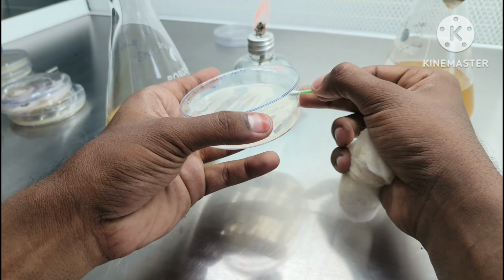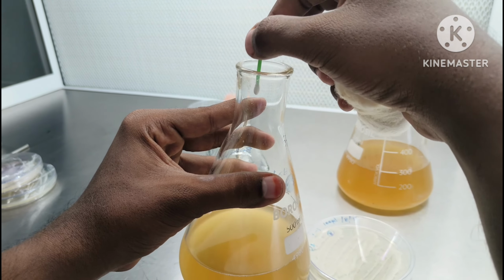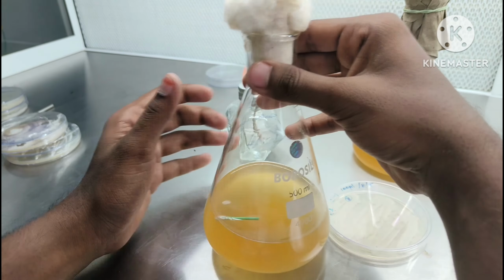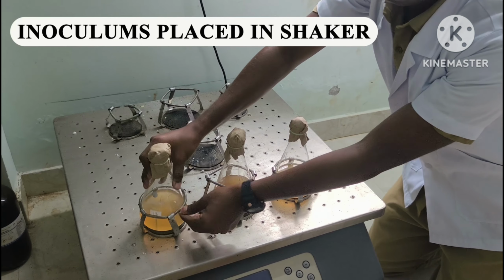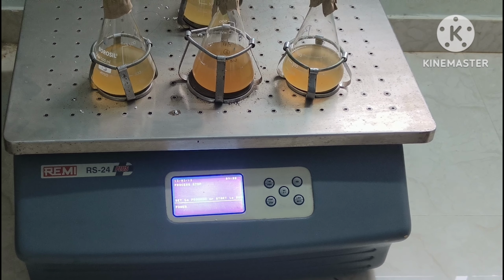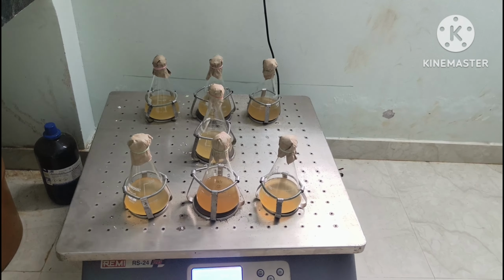A loop of bacterial mixture was taken out using a sterilized earbud. It was later inoculated in the sterilized nutrient broth under aseptic condition. The inoculated broths were then placed on a rotary shaker for bacterial multiplication. Broths were placed on the rotary shaker at 150 rpm for 2 to 3 days.